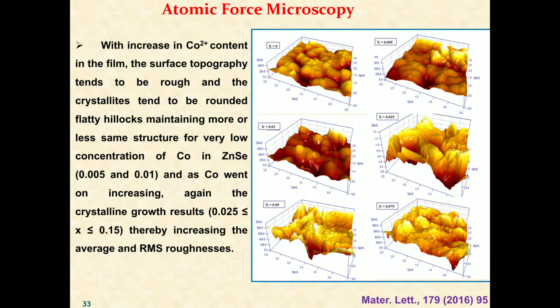Atomic force microscopy, that is AFM, was also used for topographical studies. The surface topographs consist of hillocks and valleys, suggesting the crystalline nature.